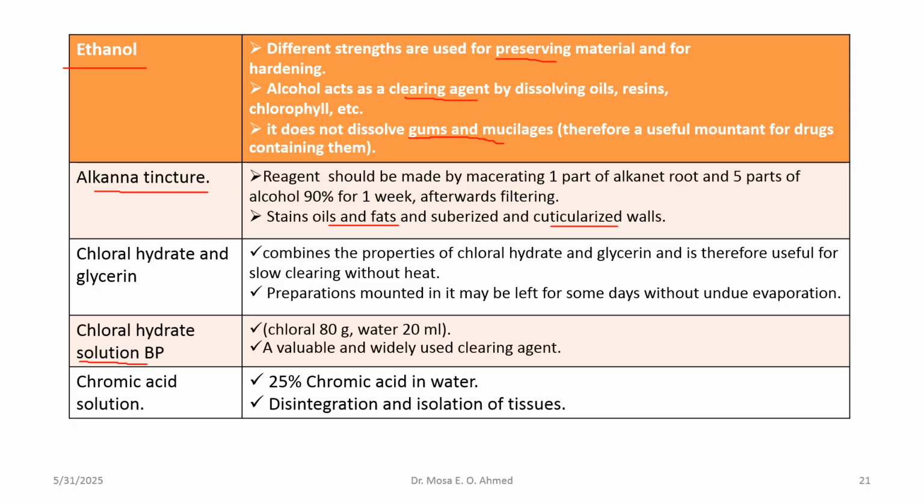Chloral hydrate is known as a clearing agent.